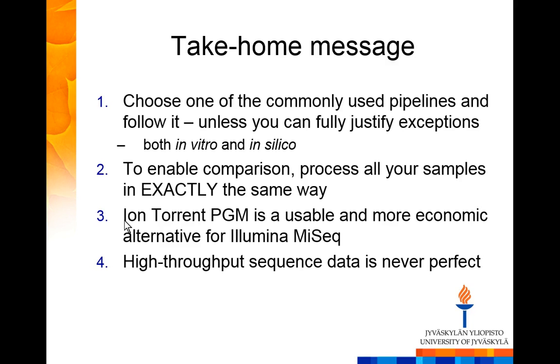Again, the same take-home messages. I hope I managed to convince you to think about this. If you don't know exactly what you're doing and why you would change things, then just do what everybody else is doing. And really remember that everything you do affects the recovered community profiles and relative abundances. So process all your samples in exactly the same way.